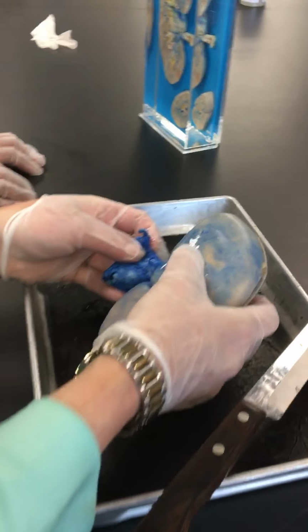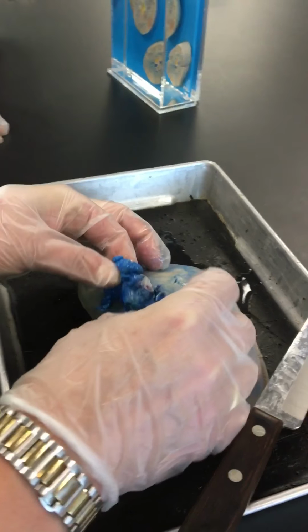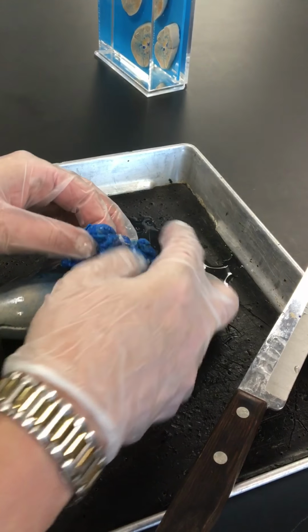Start on the outside. We want to find our renal artery and vein. It's our artery.